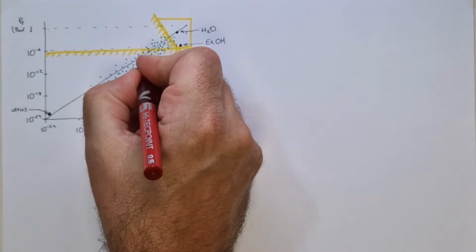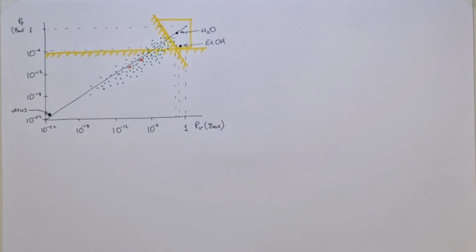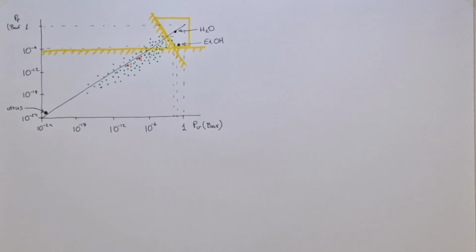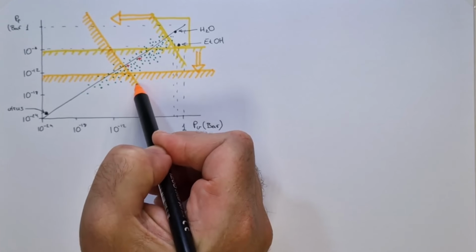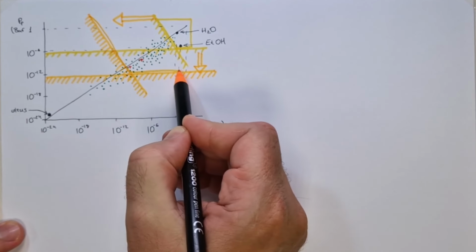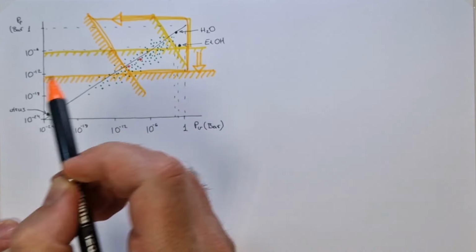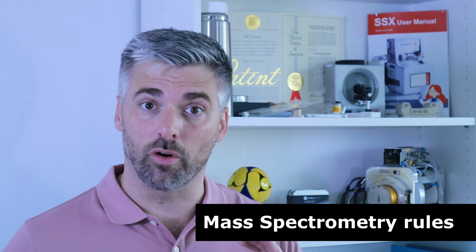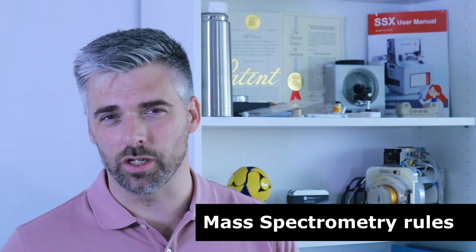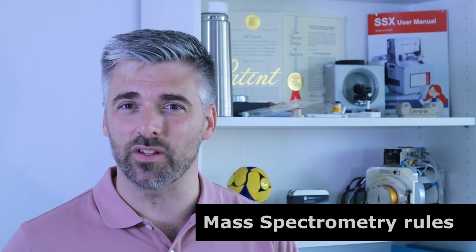Imagine this was a biomarker, or this. To find it, we need to detect it reliably. That means improving the detection limit and the volatility limit. With better instruments, we will be able to interrogate more molecules and find more potential biomarkers. And today, that means mass spectrometry. Why? A mass spectrometer counts ions and measures their molecular weight with great precision. Some instruments are so sensitive they count ions one by one, and that gives us an extremely low detection limit.